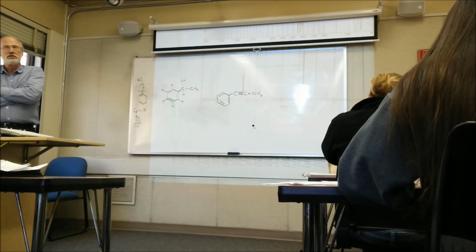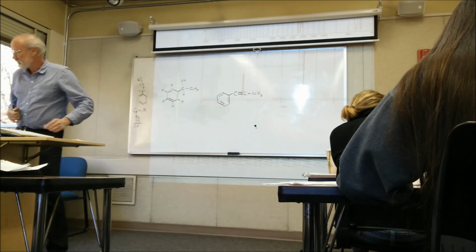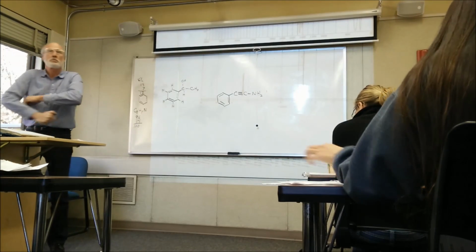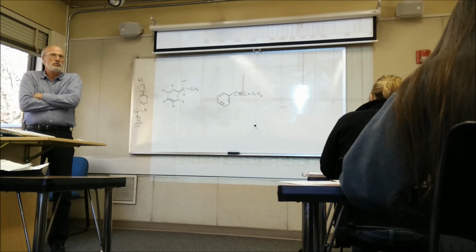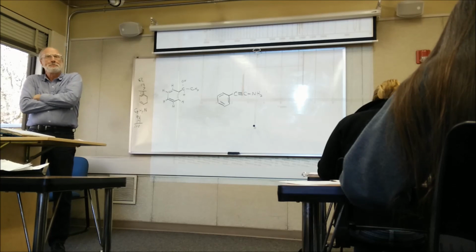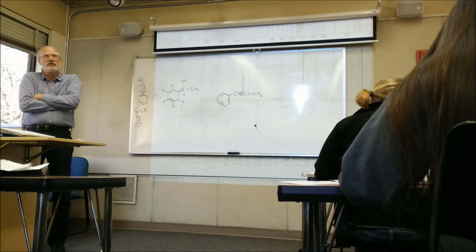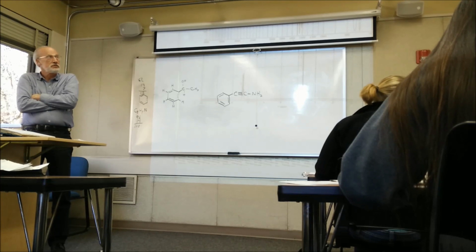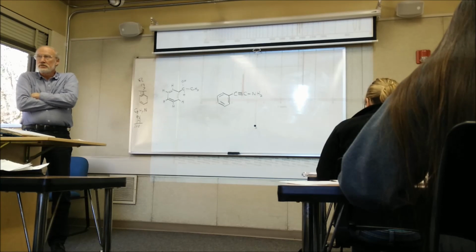Where would we find the C triple bond C stretch? It's under the CC stretch, 2260 to 2190. There it is, we've got one at 2250 roughly.